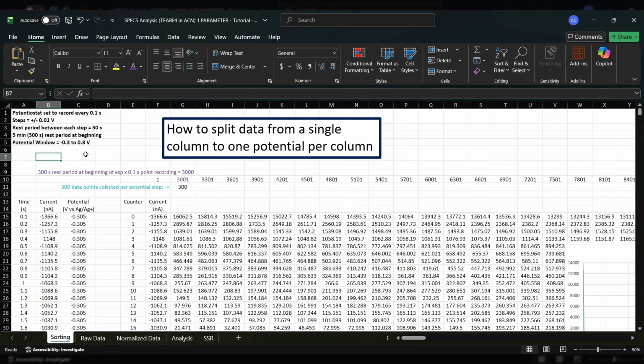Okay, so our group typically deals with our data with Excel. There are plenty of other software packages out there and you can use whichever you like, but today we are just going to work with Excel.